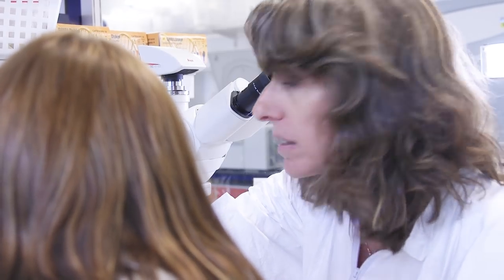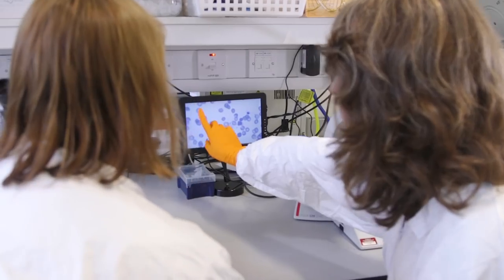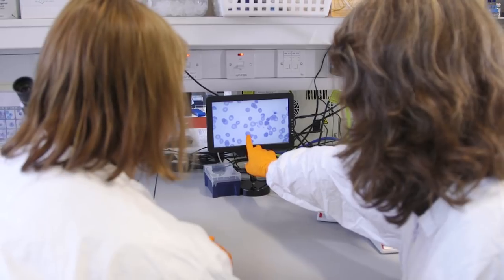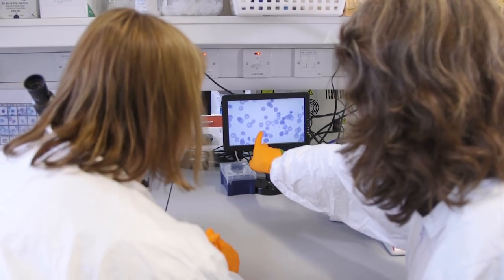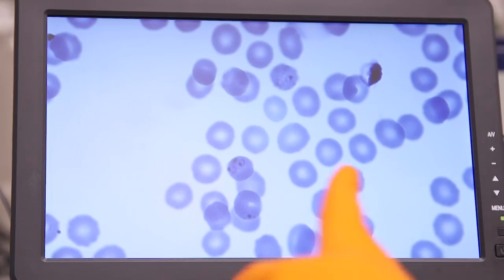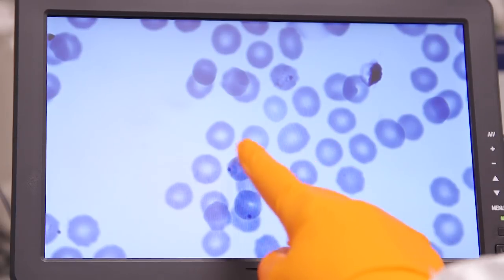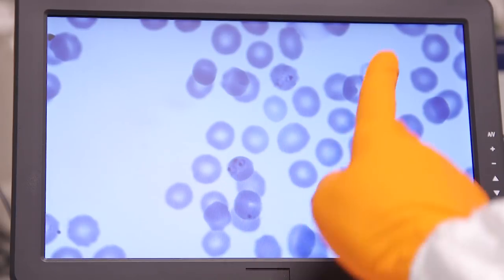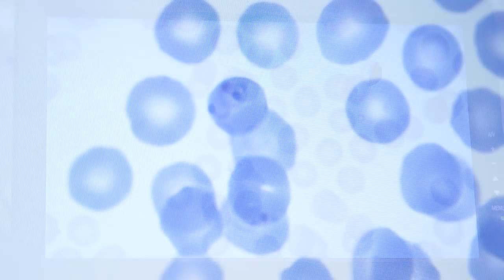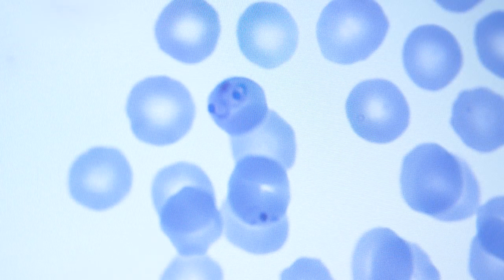On the microscope, what we look for is the stages of the parasite that are present in the culture. We see the red blood cells in light blue, and within the red blood cells we can see darker purplish forms of the parasite.